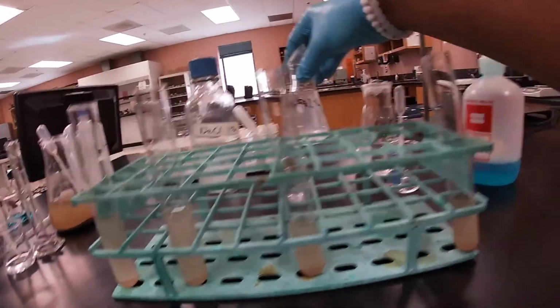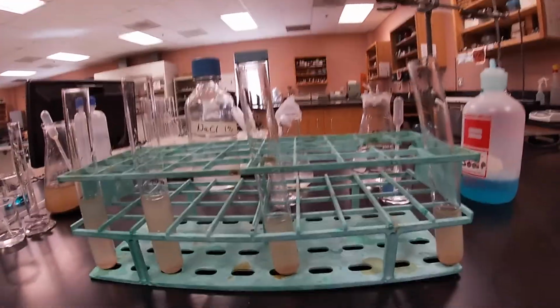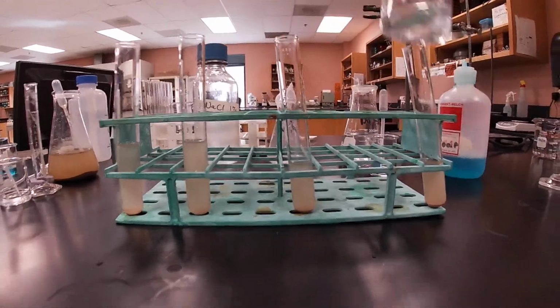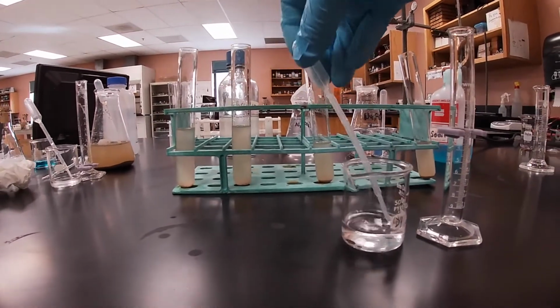Now we're gonna get our aluminum sulfate solution. So, get our beaker with our sample in it. I'm gonna measure out 5 milliliters.